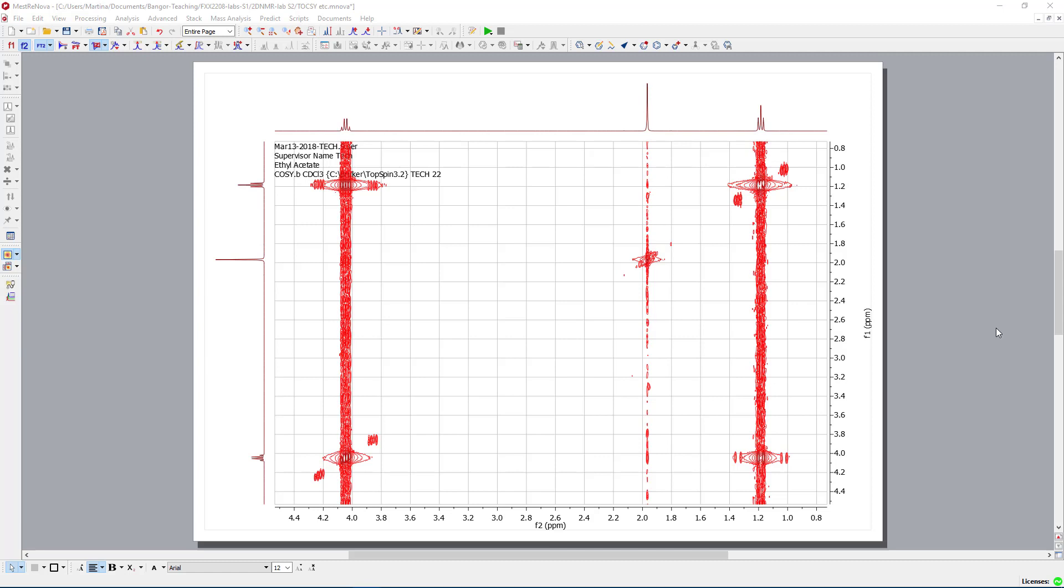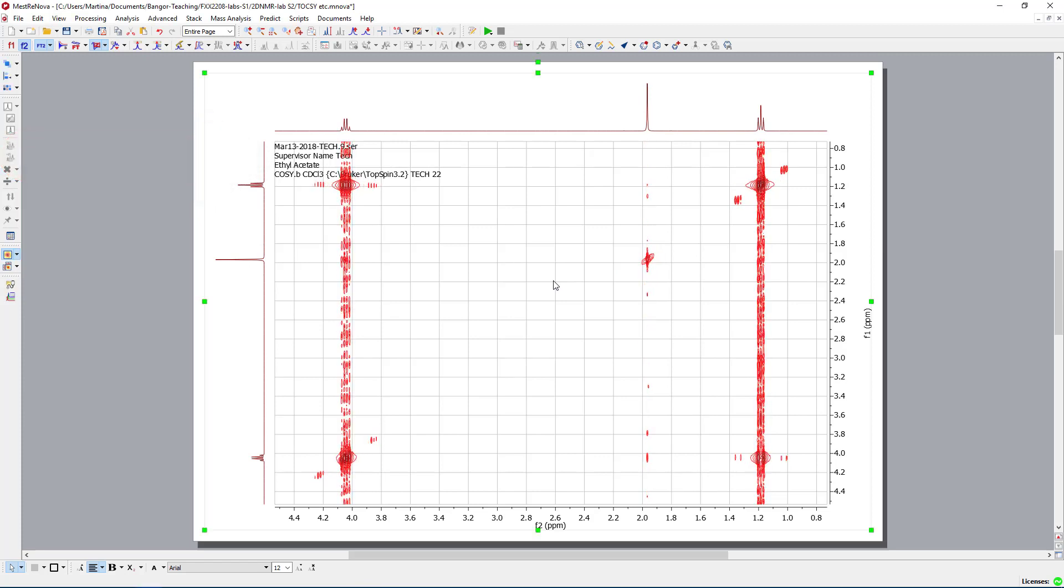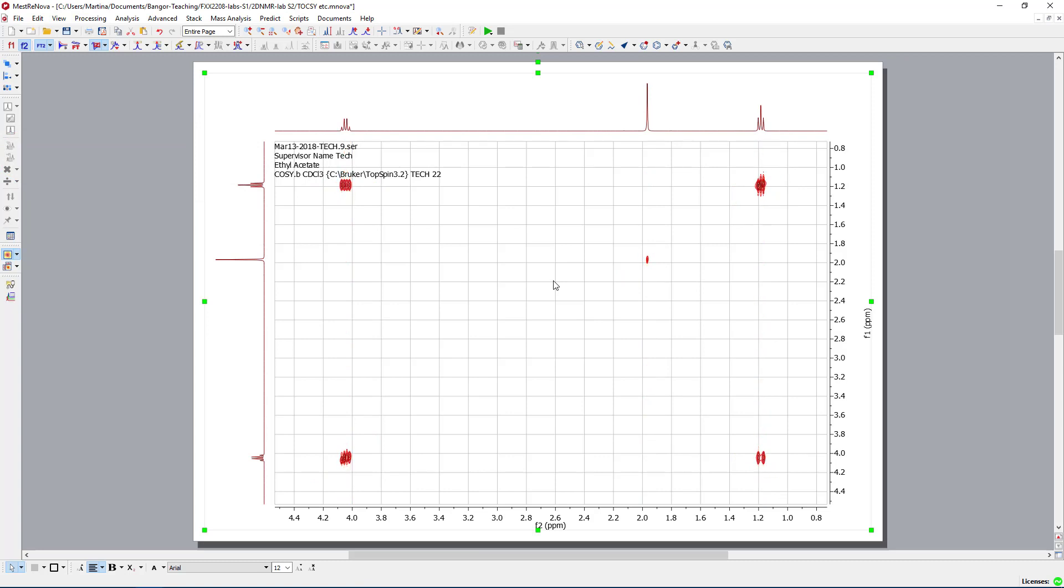But let us start a bit easier by looking at the COSY, so not the TOCSY, the COSY of ethyl acetate. At the moment it's a bit too deep, so I will just use my wheel to make it a bit more COSY-like. And we see that we see extremely little.